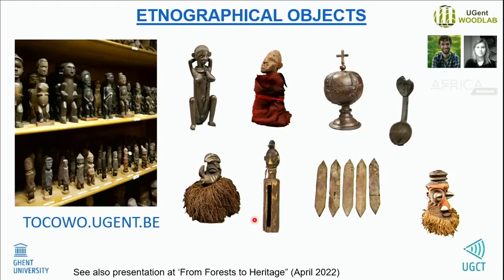Now these wooden objects, and Marta also mentioned it, it's difficult if you have a relatively big object, how you have to mount it so that you can still get enough resolution to get some interesting information about that object, and especially if you go to those tropical woods, you really need very high resolution to say something meaningful about the wood species.